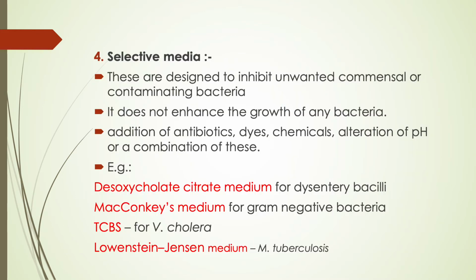All right. So for example, we have the selective media. For example, we need to inhibit some group of bacteria, and we need to grow some other group of bacteria. So this is called selective media. For example, MacConkey agar.